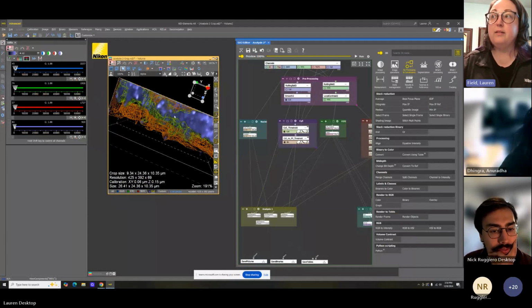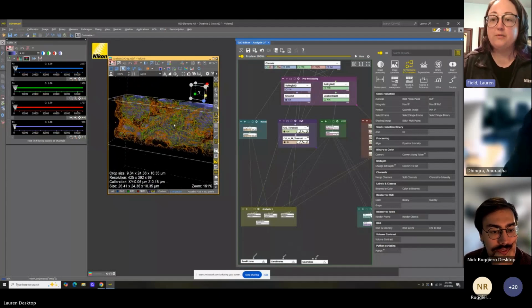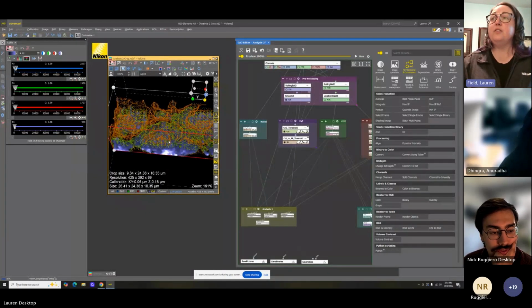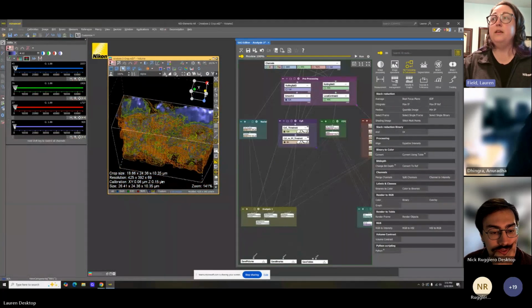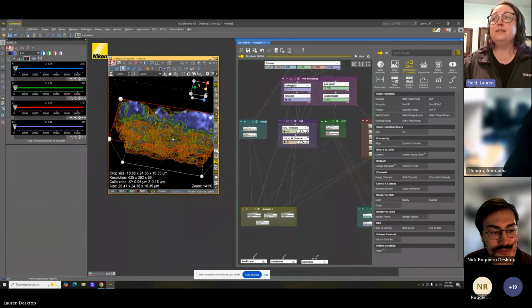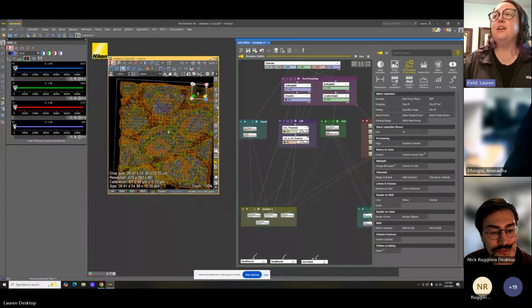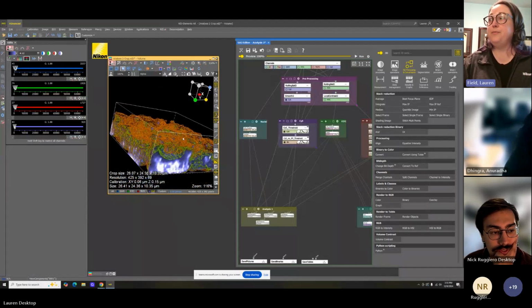For me, I would think you might want the green label. That may not be what you are interested in. You may want to know everywhere that purple exists in the cell. So making these kinds of decisions is going to be a little iterative when you're first starting out building these routines. The software will do exactly what you told it to do. And so making a decision on what it is that you want to see out of your data is going to be very important.